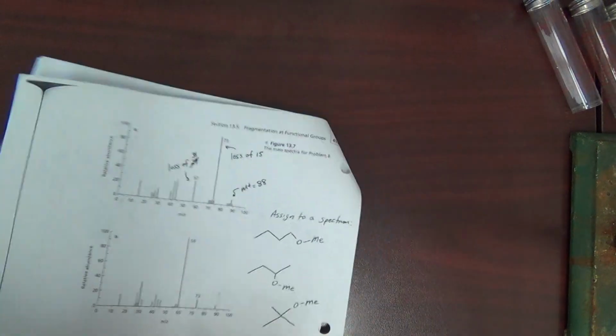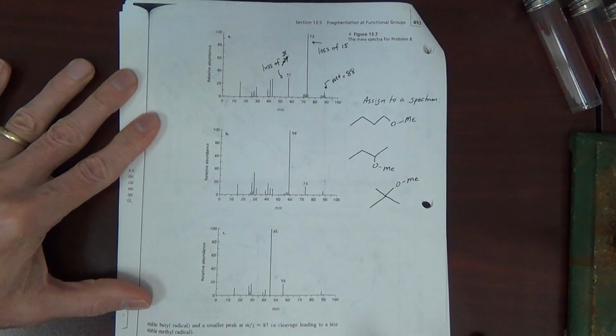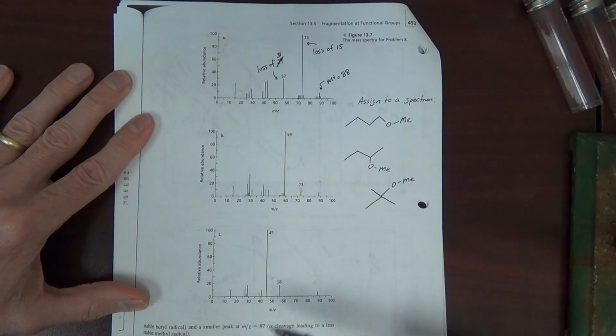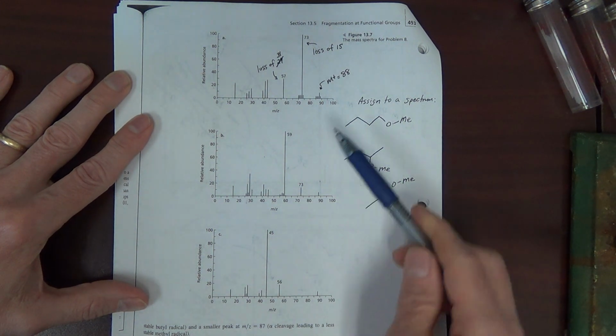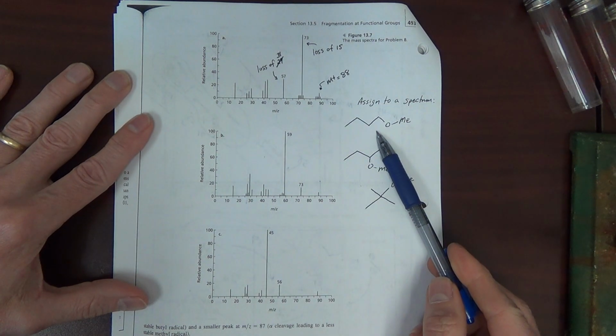Let's make our way home here. Okay, next page. This is homework. All right. We have 3 compounds and 3 mass specs. Assign each compound to its correct mass spec. All right. Type of problem you may see. You should also look in the workbook for other problems. They'll be very similar to the IR. There'll be a list of compounds, there'll be lists of mass specs, and you assign each compound to a mass spec.